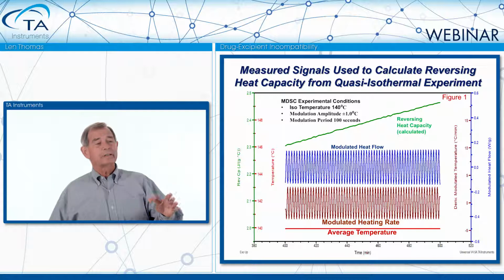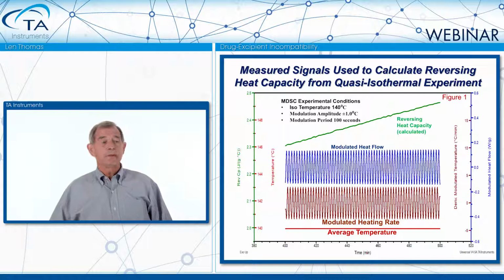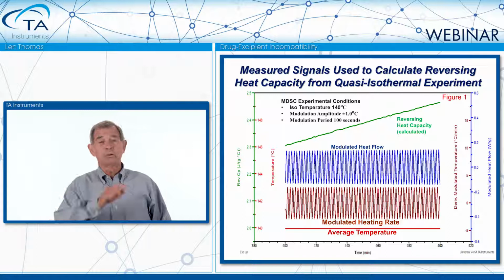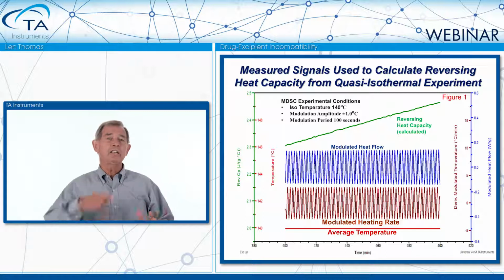And if we look at the inner axis for the brown or maroon curve, what we see is that that curve is centered near 0 in value, but the lowest heating rate is a -3, which means there's some cooling, and a +3, which means there's some heating. And you would expect that if the average heating rate is 0, we're going to be oscillating over that range between a -3 and a +3. So the heating rate is changing sinusoidally.